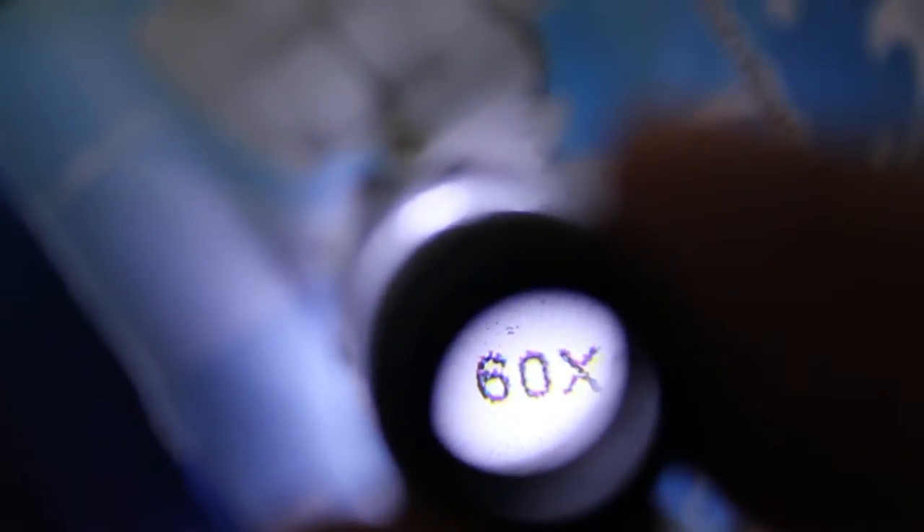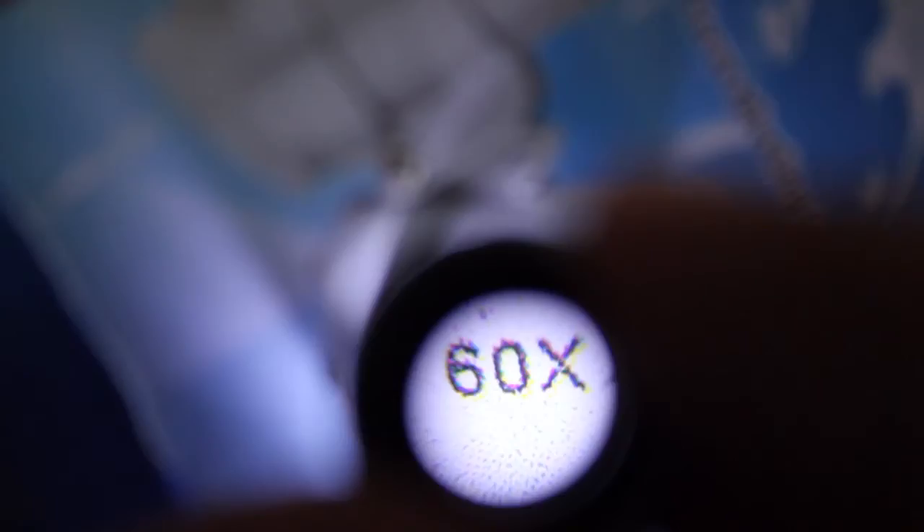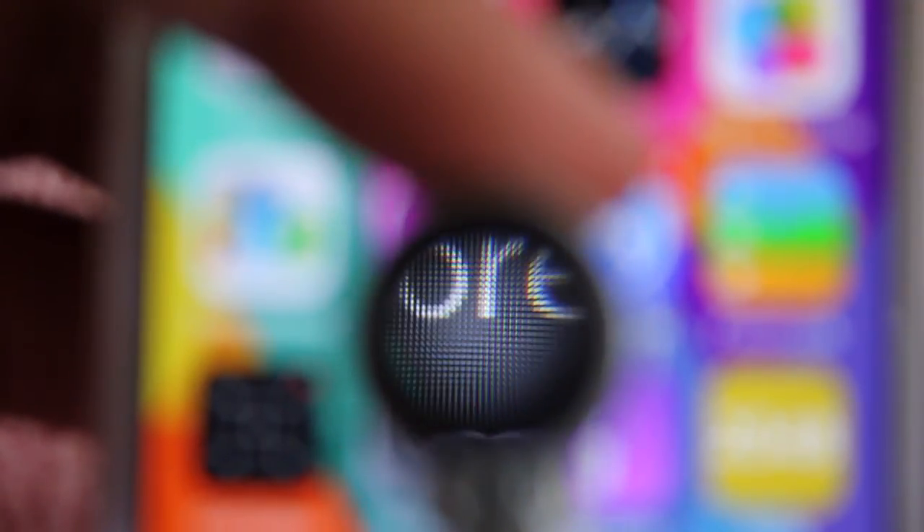This is the magnification in action — you can see the text printed and the actual colors used in what appears black: it's red, green, and yellow mixed together to create the black. This video doesn't do justice to the quality — it's pretty amazing. You can even see the individual pixels on a retina screen. Quite amazing, quite nice — check it out.